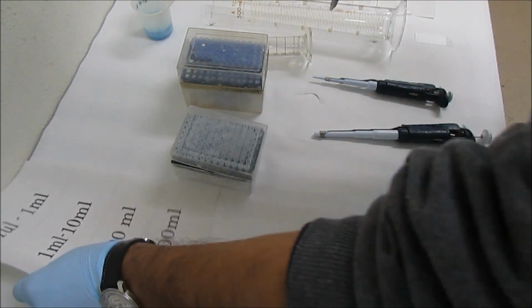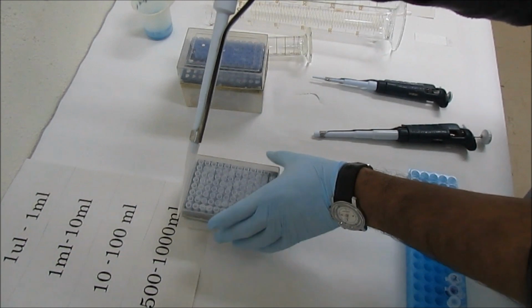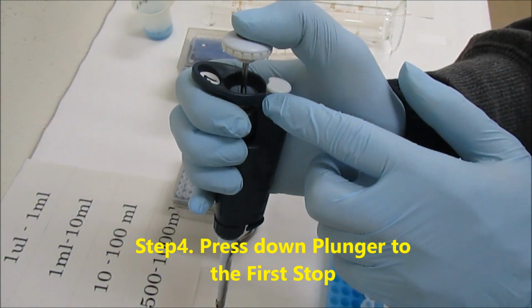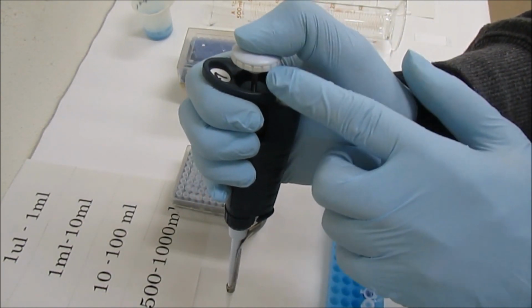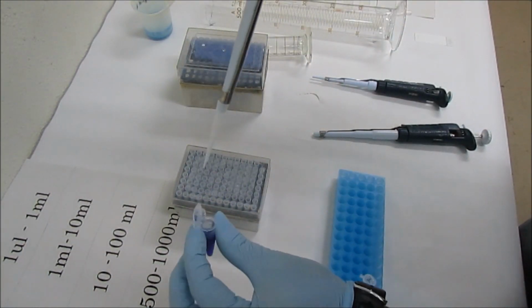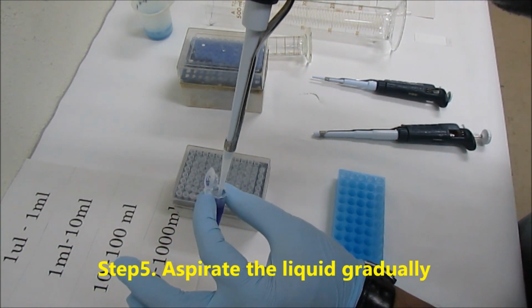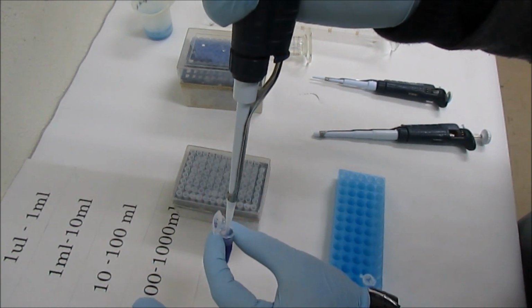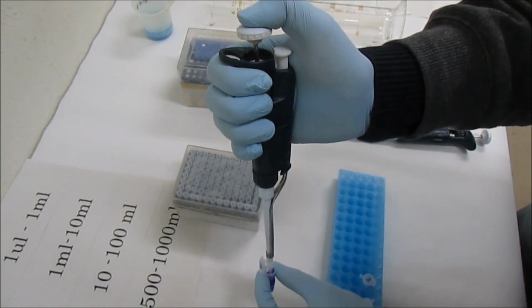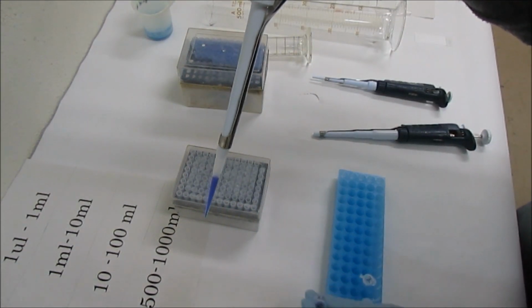First, firmly get the tip. Here you can see you get the tip, and then you press the plunger to the first stop. I press just until I feel the first stop. Fine. Then, to take liquid, I dip the tip just a few millimeters below the surface and release the plunger slowly. You see the liquid is taken.